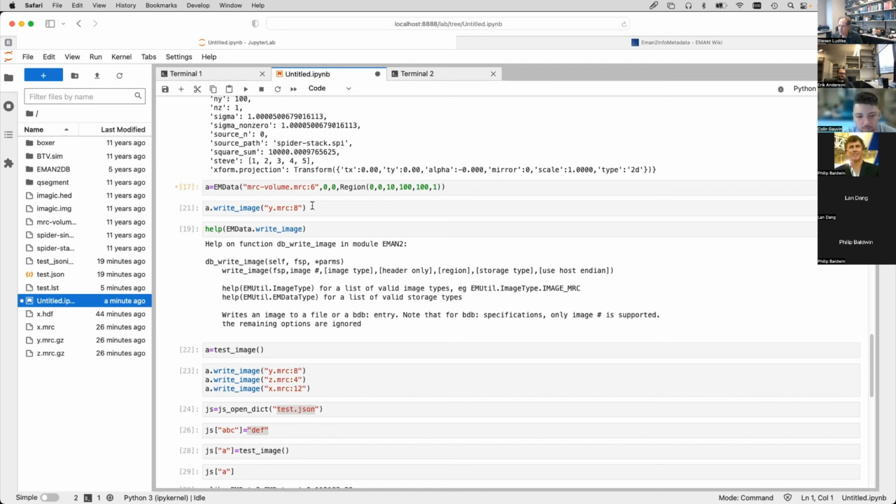I mean, that's really why we use Anaconda now for distribution, right? We used to do it the old traditional way, which was to try and rely on the system libraries and make sure you've got compatible system libraries installed on the machine. And if you don't, then you install other versions of the system libraries in your home directory and use LD library path to point to the right folder. But then you've just got this humongous logistics mess.